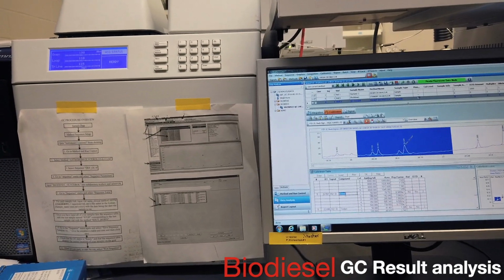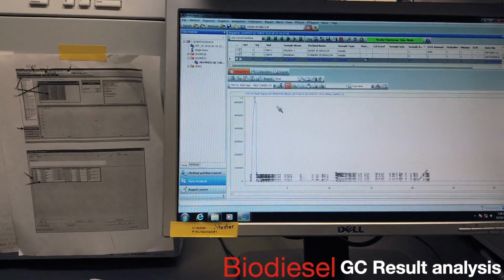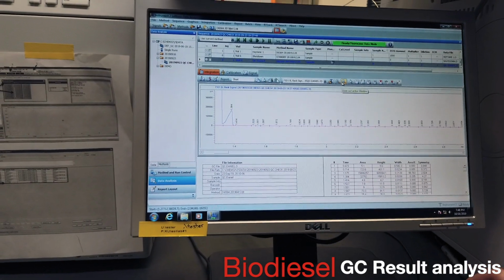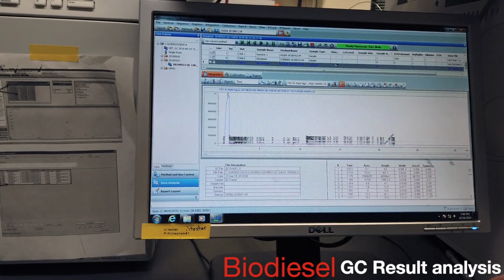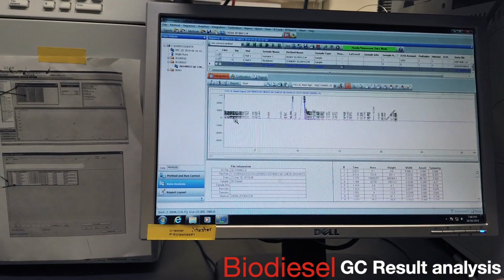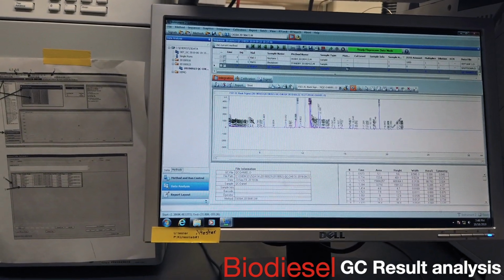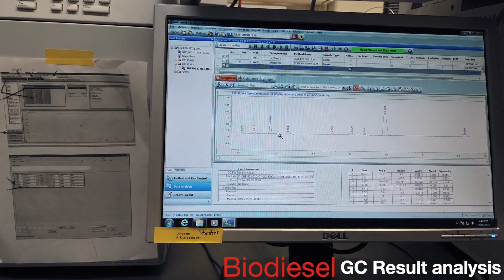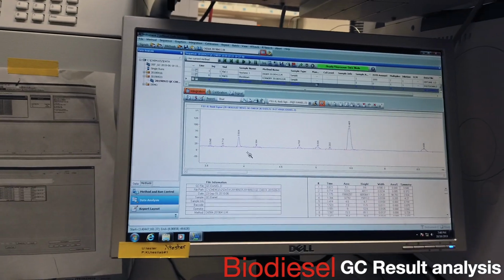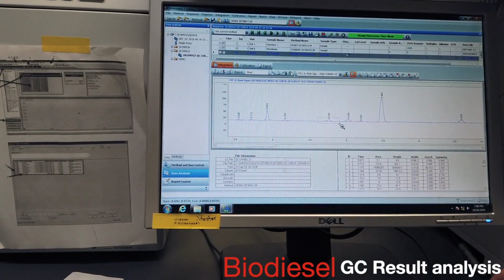I was a little bit jumbled today, so let me just start over. So here's what you do. When you go in, you want to zoom in to the chromatogram, and then you want to make sure that all your peaks are right. If you zoom in like I taught you, small but wide, after a while you will just remember the retention times. So glycerin's 4.7. So you're going to go here and ask, does that look good?